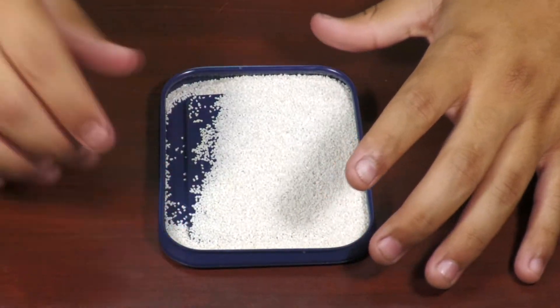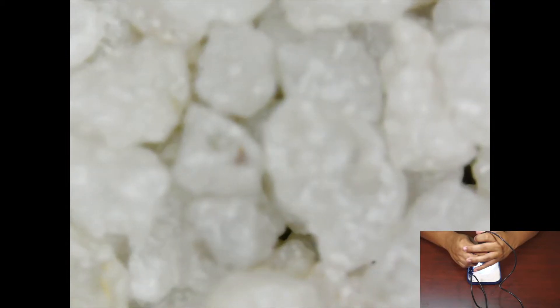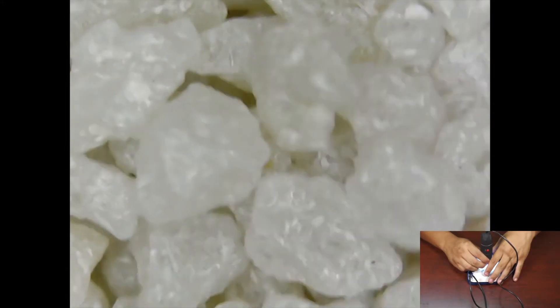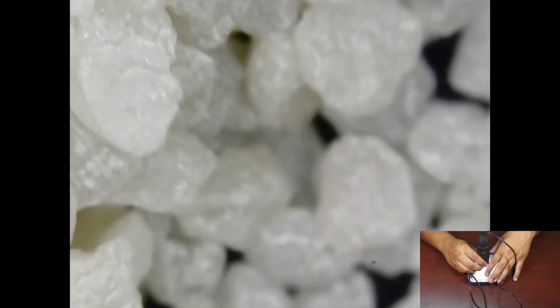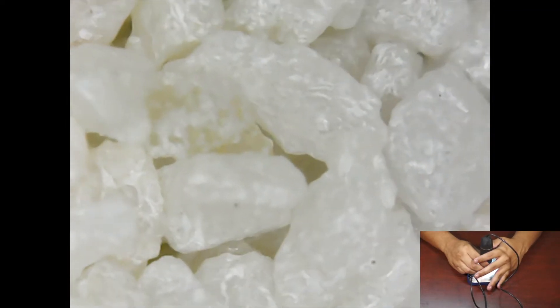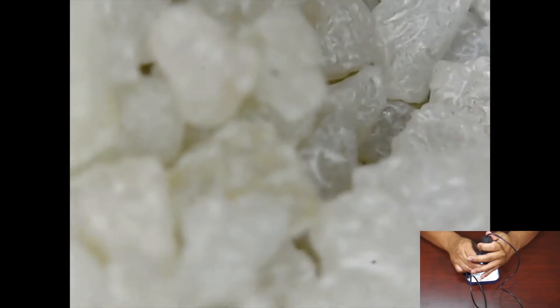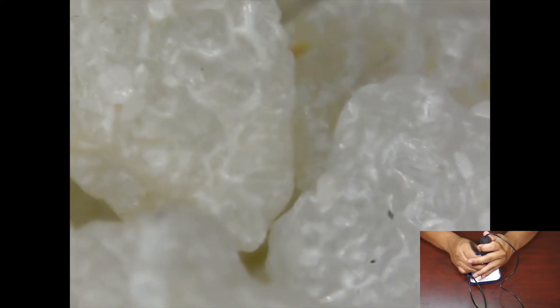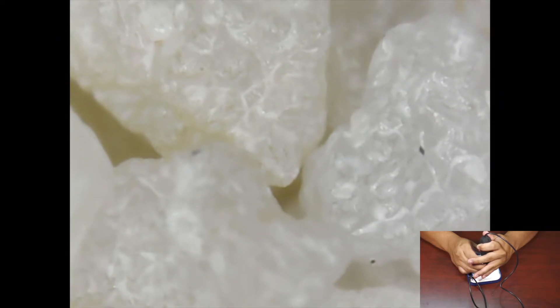Okay, so here we got some aquarium sand. Honestly, these kind of look like deformed Orbeez, like dried out Orbeez. Man, these things look giant — I bet these things are giant for ants. Let's try to zoom in just a little bit more. There's even detail on the sand, on the little grains of sand. Can you see the detail on that? The way they move kind of looks like eggs, like they're alive.